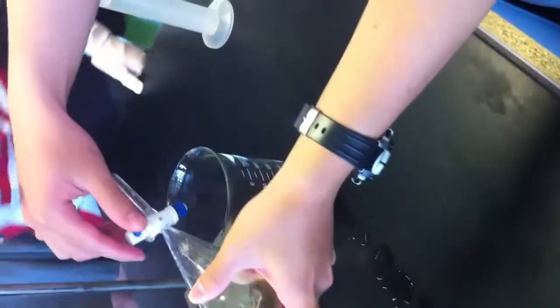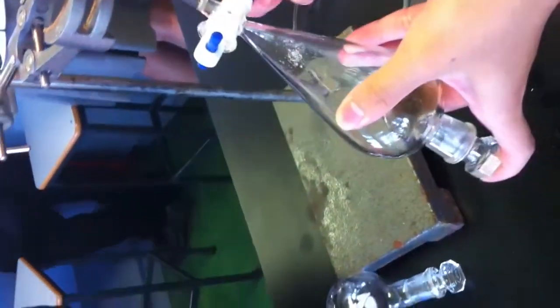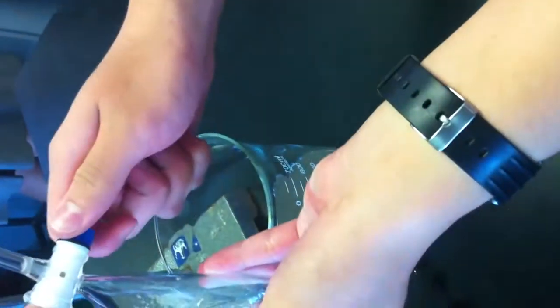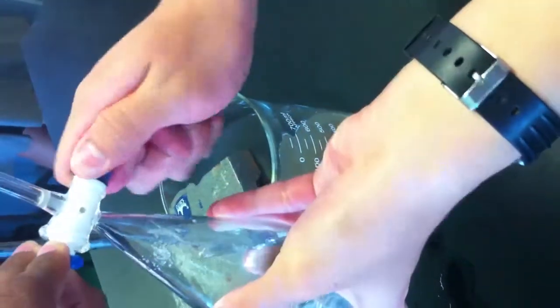Close it. And unhook it so we can shake it. Shake. Whoa, hey. No. We lost some, so it's not closed. Now tighten this. Okay, now turn. Okay, good, stop. Closed now. Now shake.